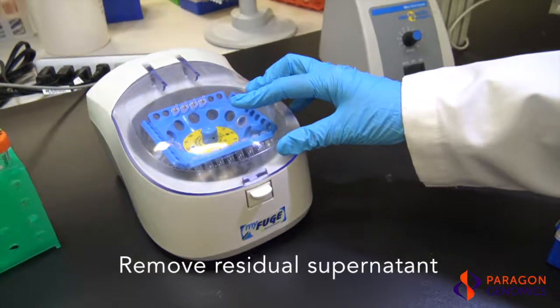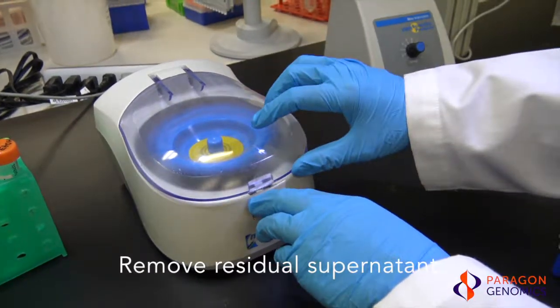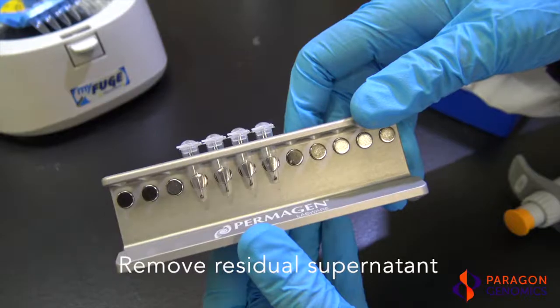Briefly spin down the tubes to collect any residual supernatant and then place the tubes back onto the magnetic rack. Carefully remove the remaining droplets of supernatant using a 10 µL pipette tip.